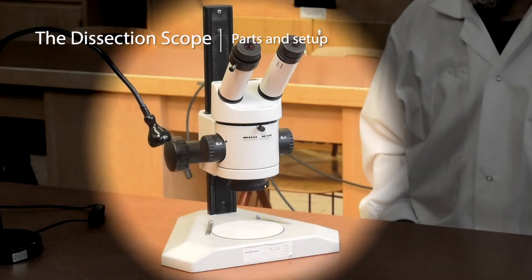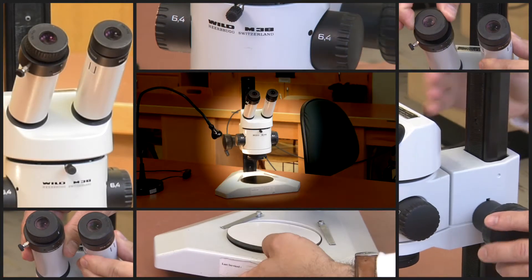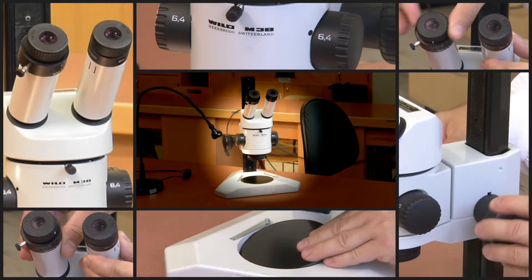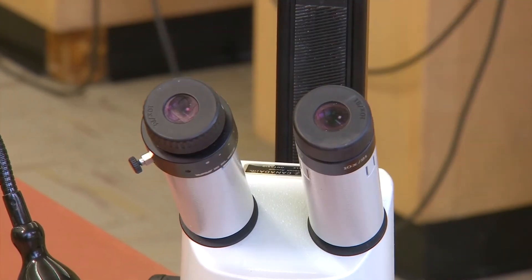In this video, we will look at the parts of the dissecting microscope and how to set it up and use it. Please note, while the basic parts are common to most dissecting microscopes, their specific design and location may differ from what you see here. Be sure you can identify all of these parts on your own microscope before use.